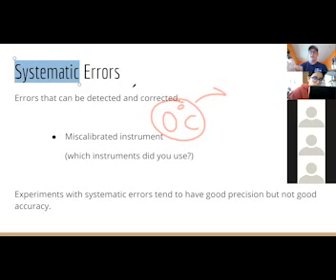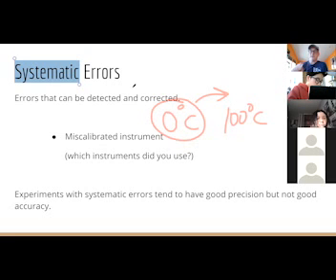Then I put it into some boiling water. What's the temperature of boiling water? 100 degrees. 100 C, exactly. So that's precisely 100 degrees C. So I take it out of the ice water, which is 0, I put it in the boiling water, which is precisely 100, and I punch into the thermometer that the signal it's giving off now is equivalent to precisely 100.00 degrees C.